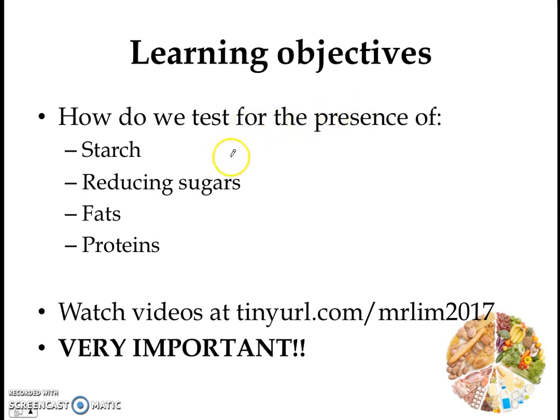Well, hello everyone to this final lesson on the topic of nutrients. Now in this last lesson, we're going to be looking at food tests. Now we've already talked about the different types of nutrients. We had starch and sugars, fats and proteins. And now we're going to look at what kind of test we can carry out in the laboratory to test for the presence of these nutrients.